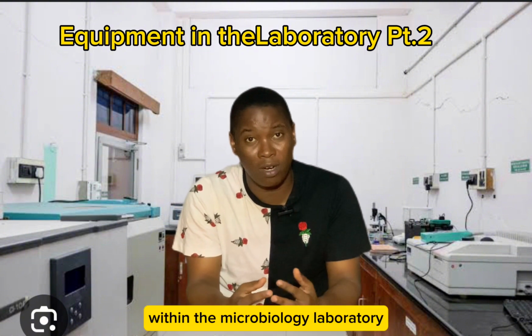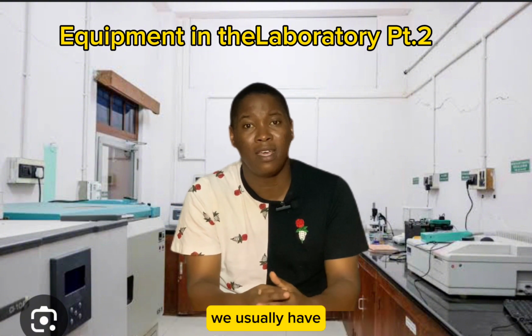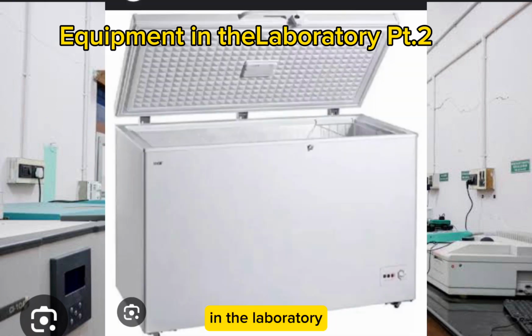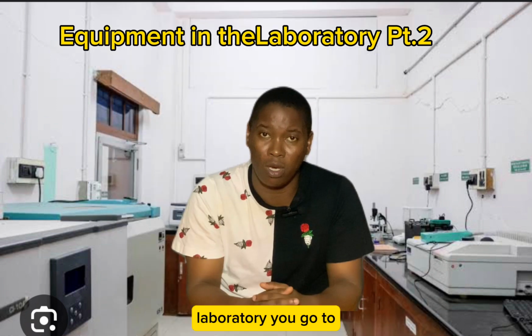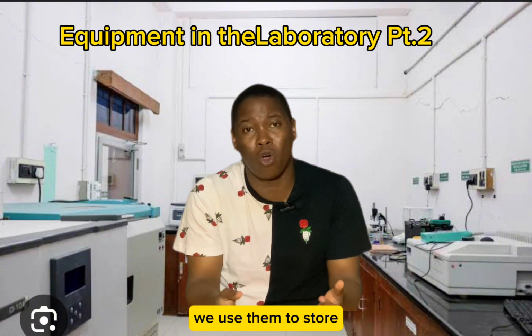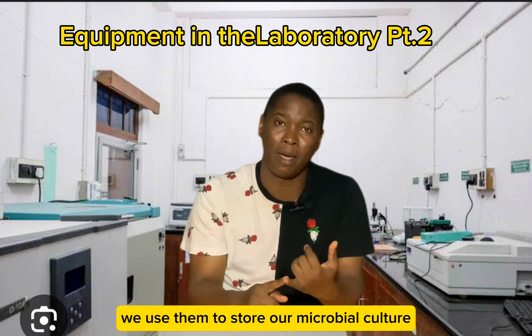And lastly, within the microbiology laboratory, we usually have deep freezers and fridges. Now, we use all these. There are also equipments in the laboratory, and there's no standard laboratory you go to where you won't see deep freezers and fridges, because we use them to store a lot of our samples. We use them to store our microbial culture.